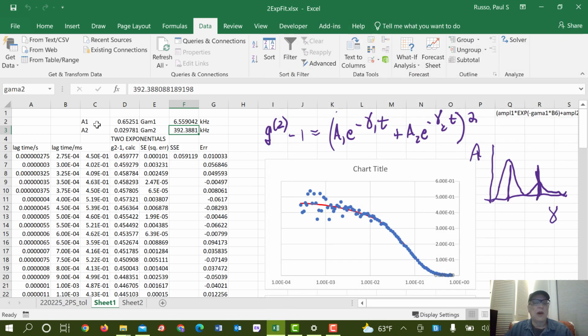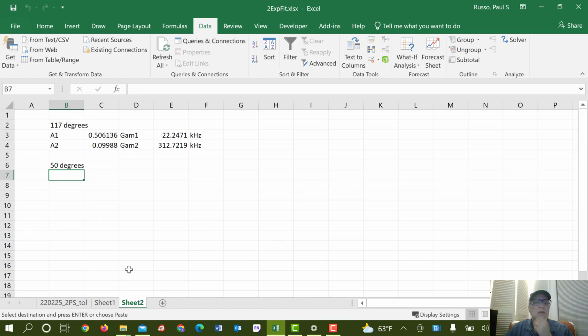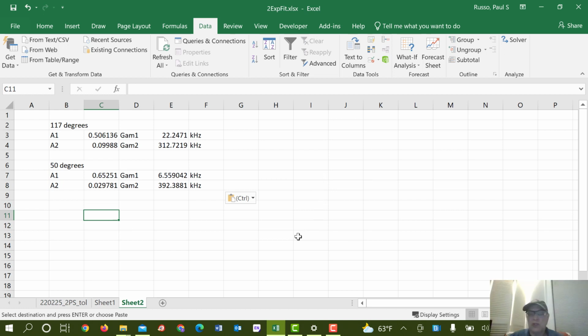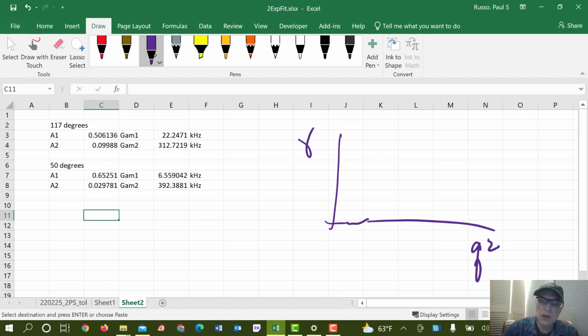And so then you would drop these data in over here. And at the end of the day, you're going to assemble a plot, which I'm at least reasonably certain is going to look semi-respectable, of gamma versus q squared, where the fast ones do that and the slow ones do that. I guess we should have 8 of these.